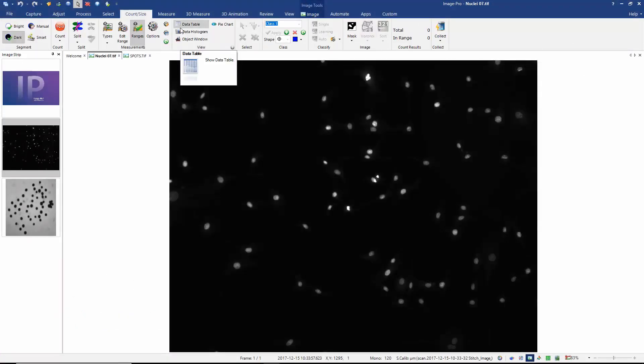In order to segment objects, we have to help ImagePro identify the intensity range of our objects, and we may wish to add additional information such as object size range or how to separate joined objects. In this image, I'm looking to identify the bright objects. Some of you recognize them as Hoechst stained nuclei. The important point is that we want to separate the bright objects from the background. This image is a 12-bit grayscale image which means that the pixels are in the intensity range of 0 to 4095.